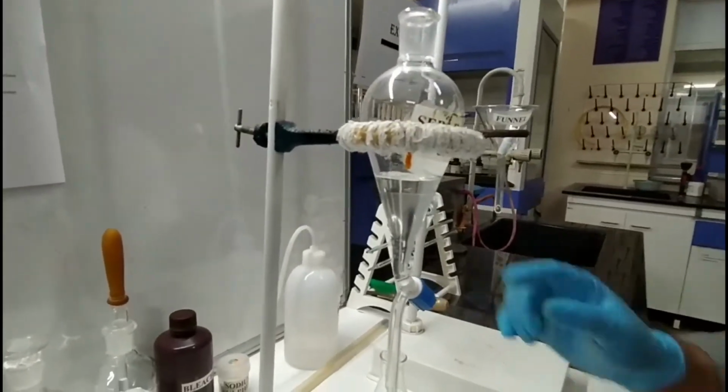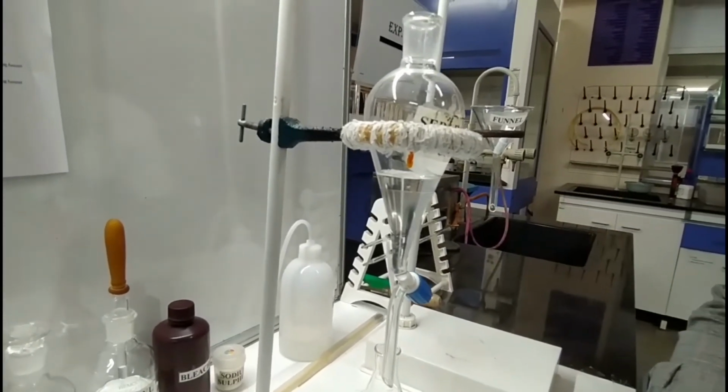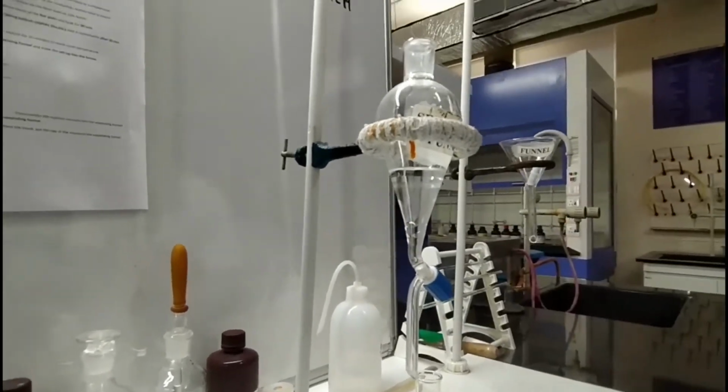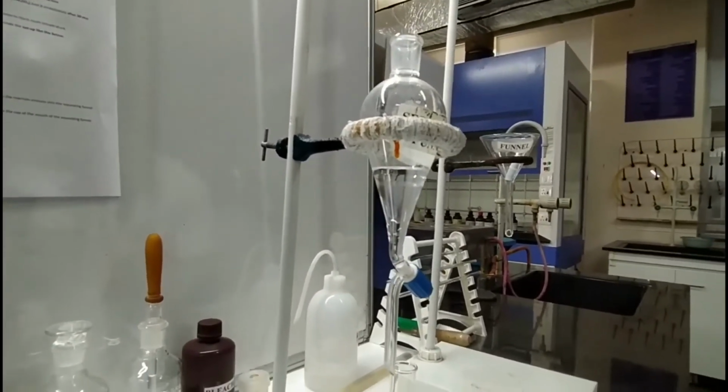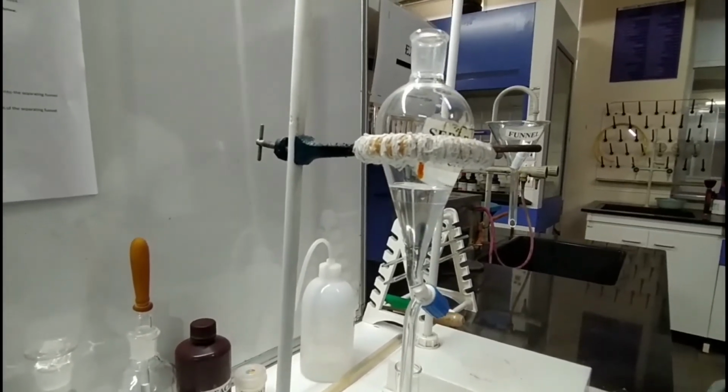Now you can see two layers are separated over here. The first, upper layer is the diethyl ether, and the second, the lower one, is the water. So the lower one is the aqueous layer and the upper one is the ethereal layer.